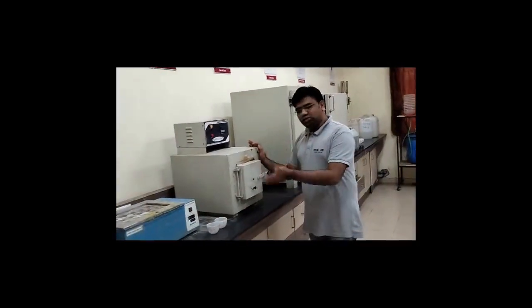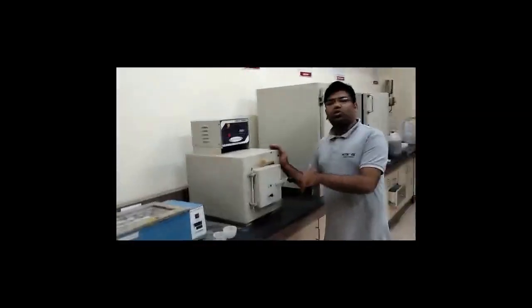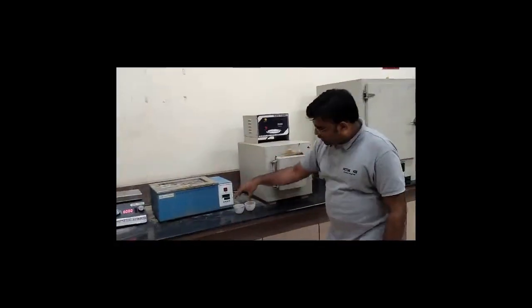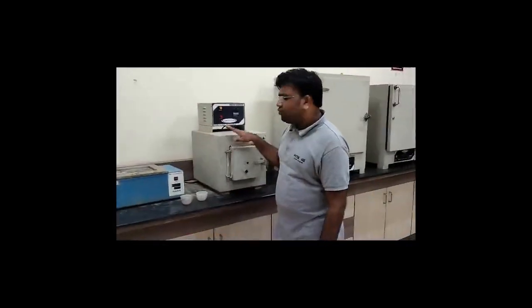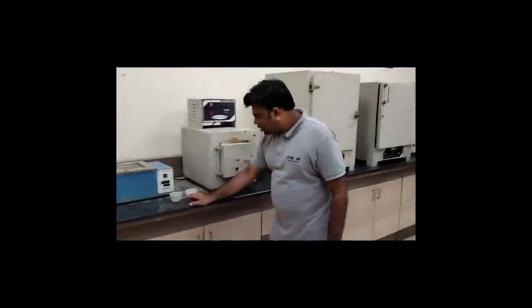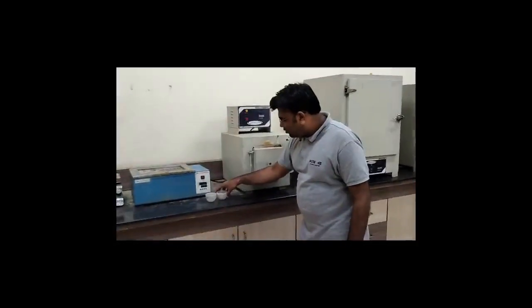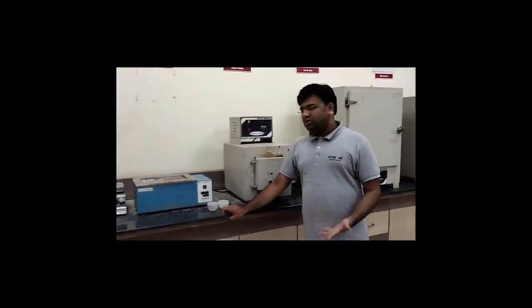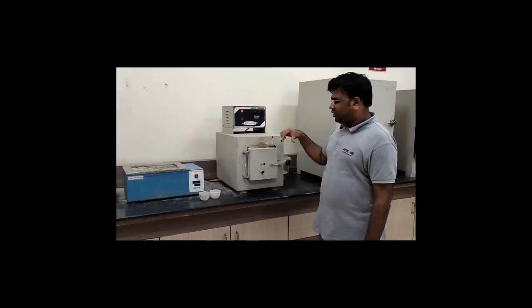What we are going to do is keep the crucibles first, and then we are going to start this muffle furnace. Now you have to remember, it is a very high temperature, around 550 degrees Celsius. So all that we have written here, the name of the crucible, like crucible A and B, can also get erased. So what you have to remember is how you have kept the crucibles, in what sequence you have kept the crucibles. That is very, very important.